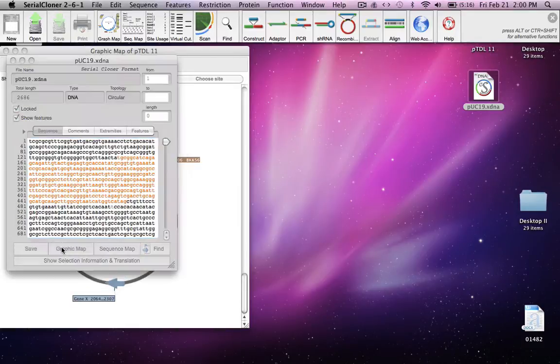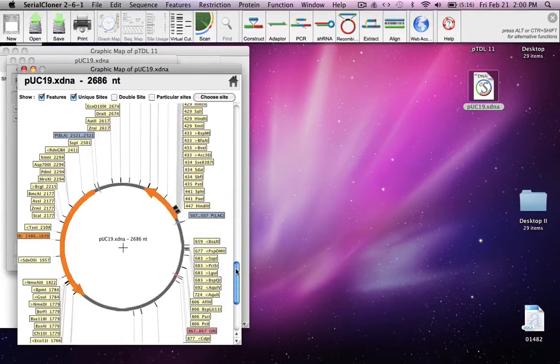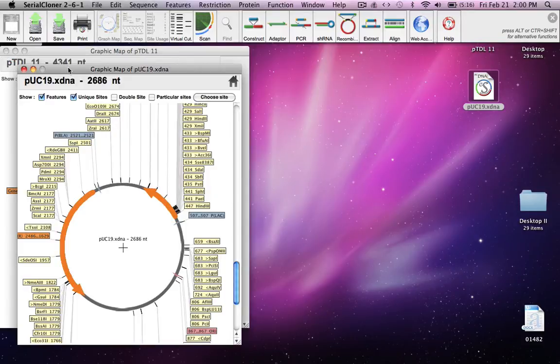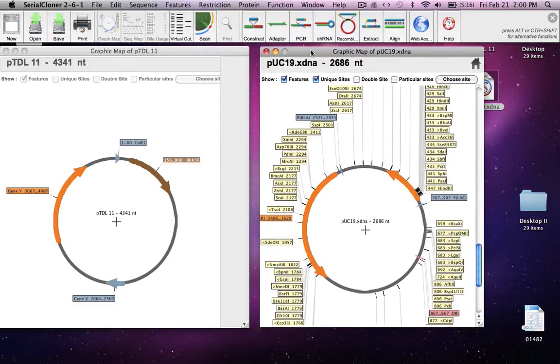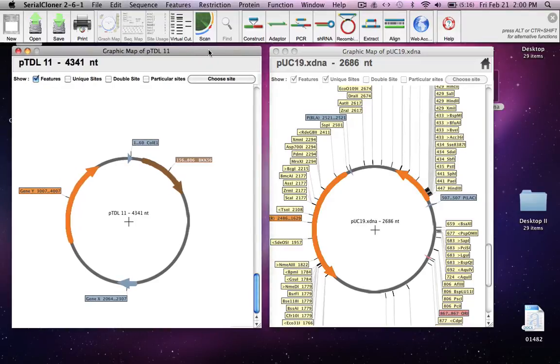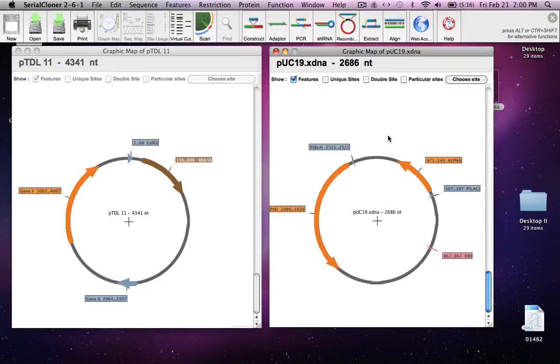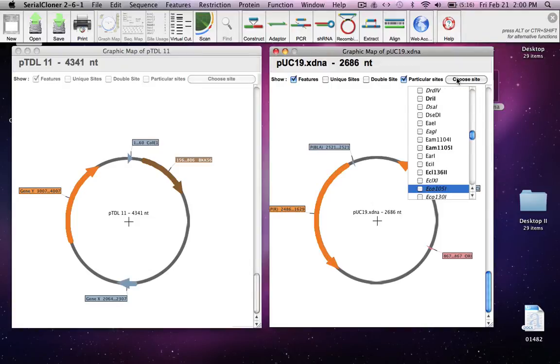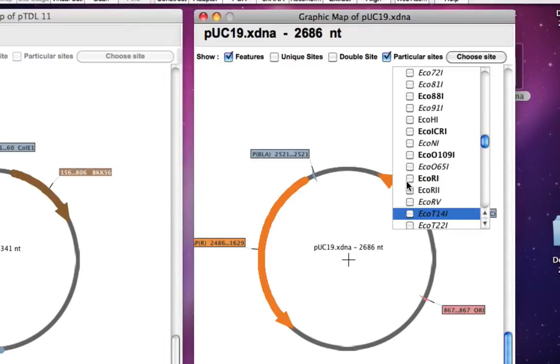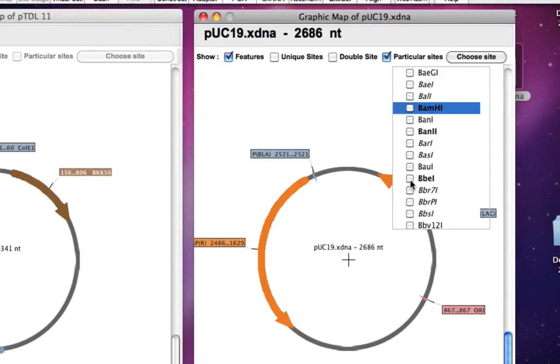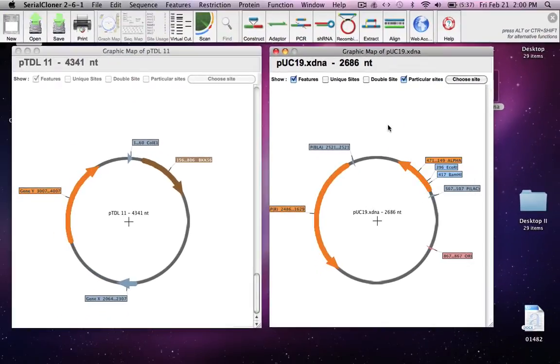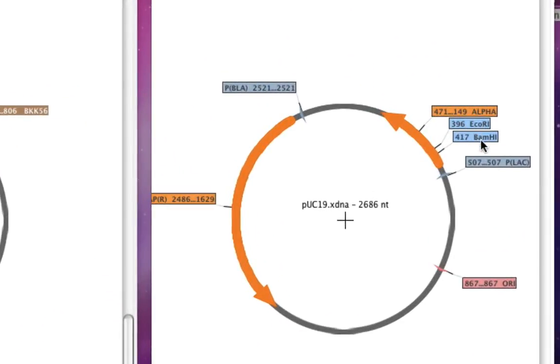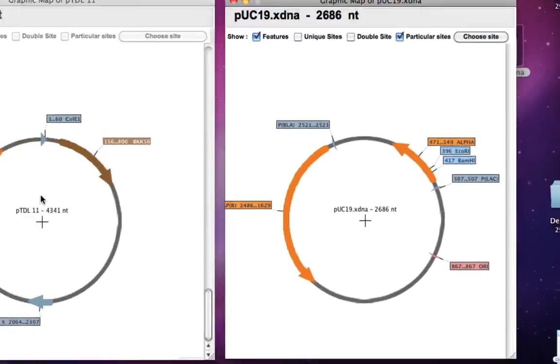Open the graphics map for PUC19, and again I'll remove all the unique sites displayed. Instead, we'll visualize only the restriction sites we're concerned with. We'll go to particular sites and choose ECO R1 and BAMH1 from the selection menu. Here we go — these are the ECO R1 and BAMH1 sites that we want to use to clone gene Y from plasmid TDL11.